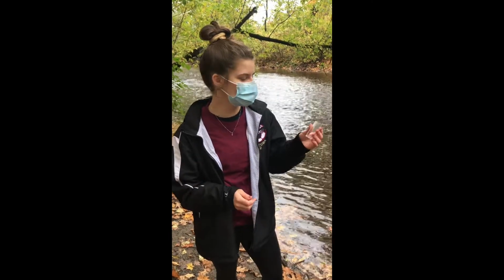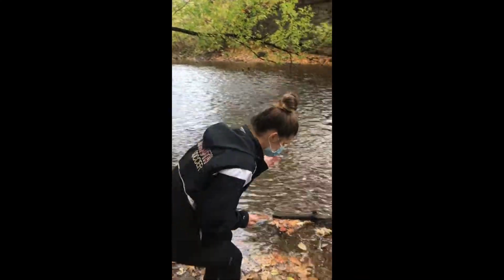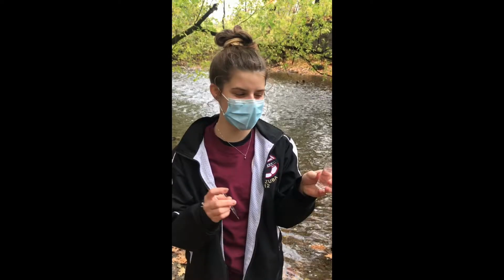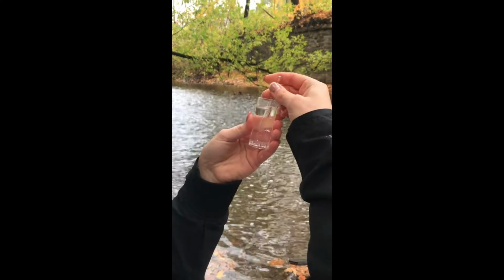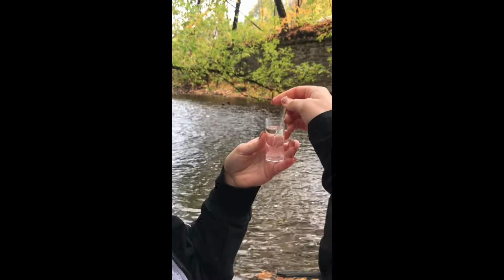So the first thing you want to do is fill the test tube up to 25 milliliters. Once you have it filled to 25 milliliters, you're going to take the ampule provided by the test kit and stick it in one of the divots, snap it off, and allow it to fill with the water from the stream.